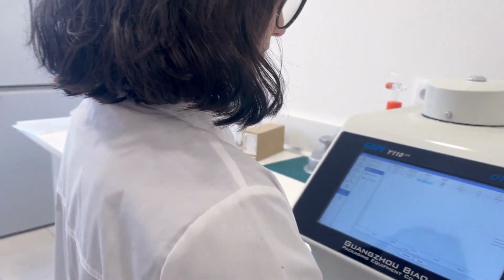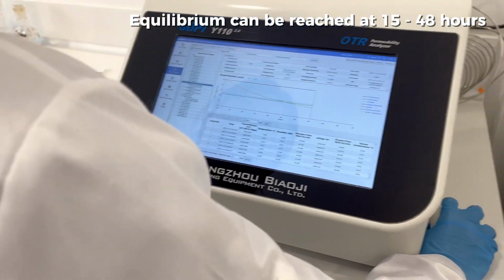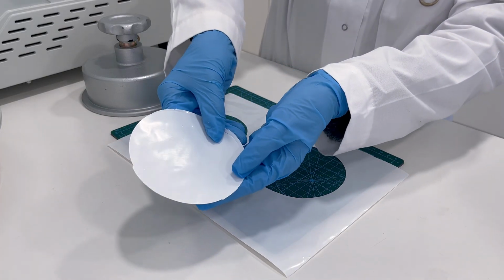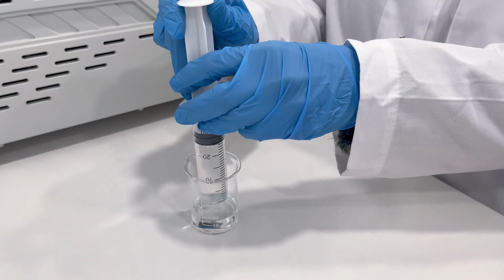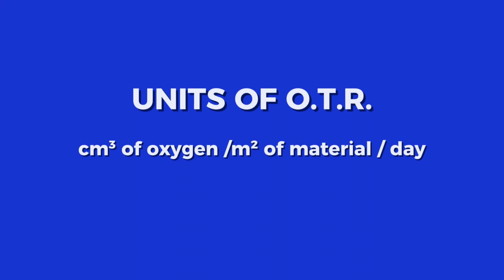The analysis continues until a steady state is achieved and the sample reaches equilibrium, which typically occurs within 15 to 48 hours depending on the material. Using a calibration curve created prior to testing with standard materials, the instrument calculates the transmittance value. Each sample is measured twice to ensure repeatability and reliability of the results. The O.T.R instrument can also measure in humidity conditions. The units of O.T.R are expressed as cubic centimeters of oxygen per square meter of material per day.